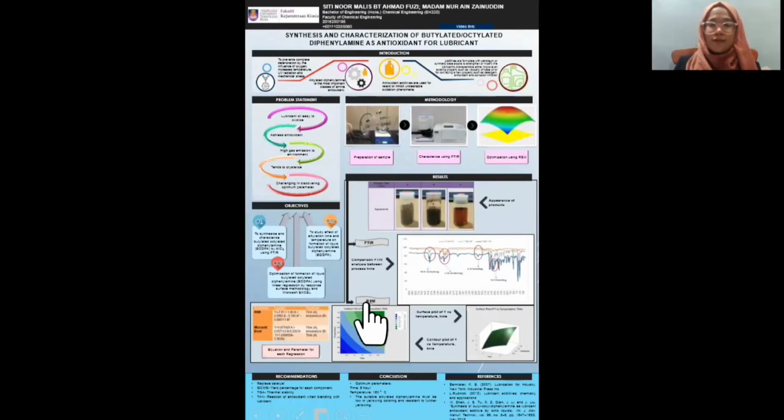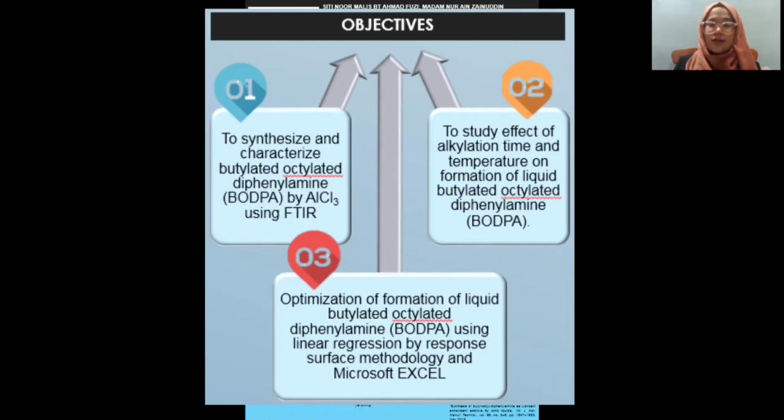The objectives for this research are, first, to characterize the butylated octylated diphenylamine using Fourier transform infrared. Second, to study the effect of alkylation time and temperature to produce liquid formation of BODPA. And lastly, to optimize parameters to form liquid formation of BODPA.